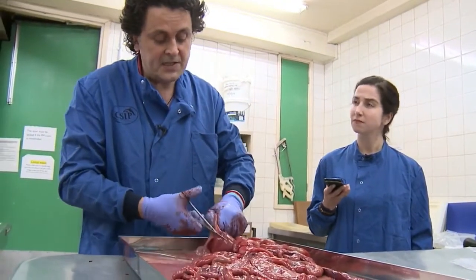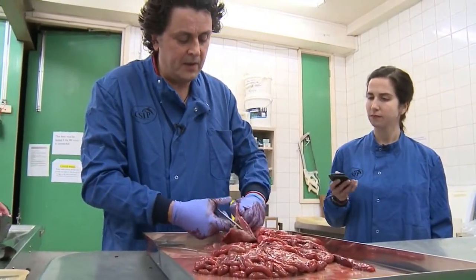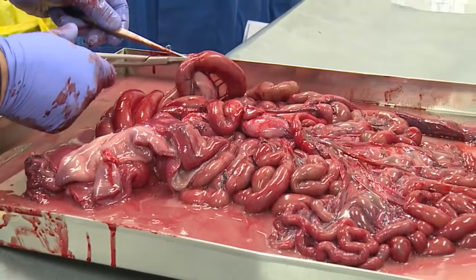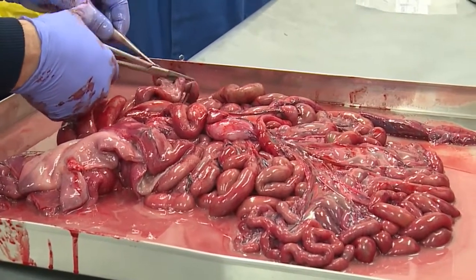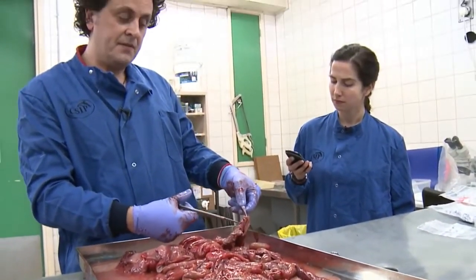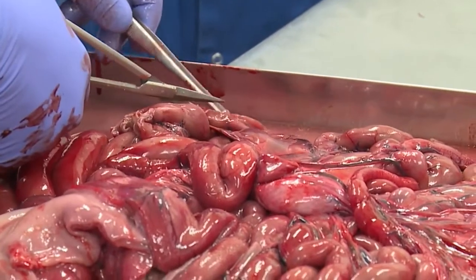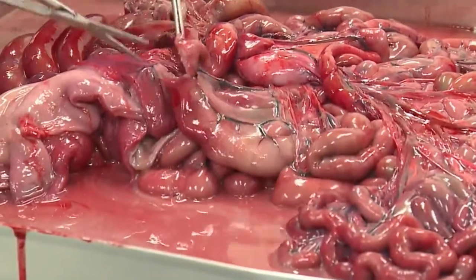And then we're going to go into the intestinal tract. And with the intestine, we don't go through the whole length of it. We just open up a representative sample here and there to see what's going on. I guess we're trying to see, is there any evidence of intestinal parasitism? We've occasionally had a few tapeworms, haven't we, Matt? Yes, not many, but... Not for a while either, but we'll just tick that off the list. So open intestine. Hopefully the camera shows we've got these folds. Again, that increases the surface area so you can absorb more of the nutrients. Okay. And we'll just nip that here and there.